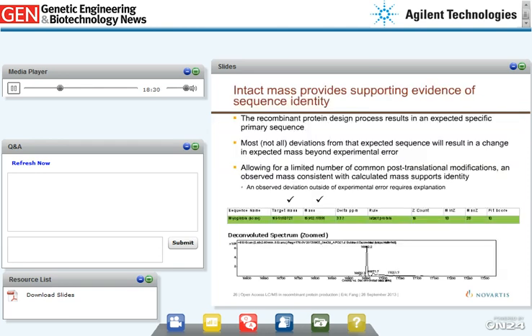Once you have an expected protein primary sequence from your design and expression process, you can calculate accurately the expected average mass of the resulting protein. If observed mass matches expected mass, you have confidence that your overall process went as expected. Here I'm using myoglobin as an example — the observed mass matches the target mass calculated from the known sequence. You use average mass because the large number of carbon atoms and instrument resolution below 20,000 will no longer allow resolution of individual isotope peaks. The table highlighted in green, along with the zoomed spectrum of the target peak, is the product of a fully automated data analysis and annotation process implemented under the Open Access Framework.